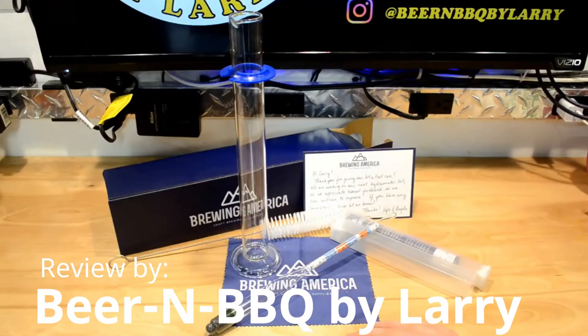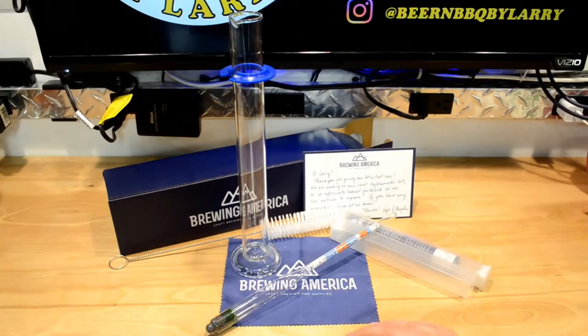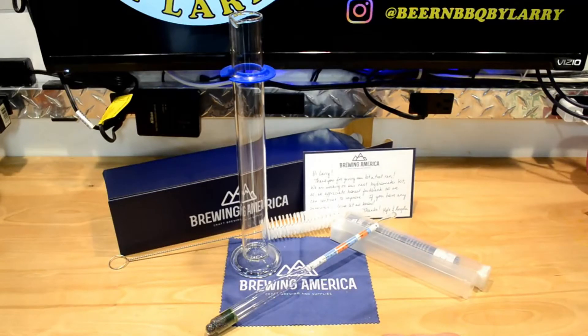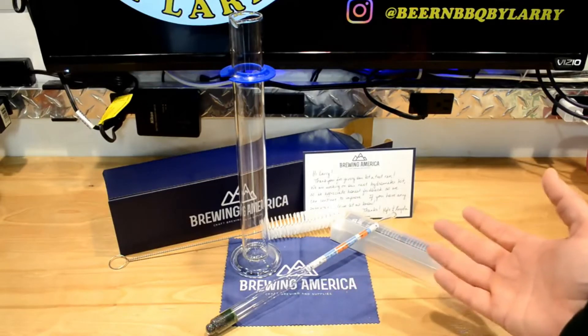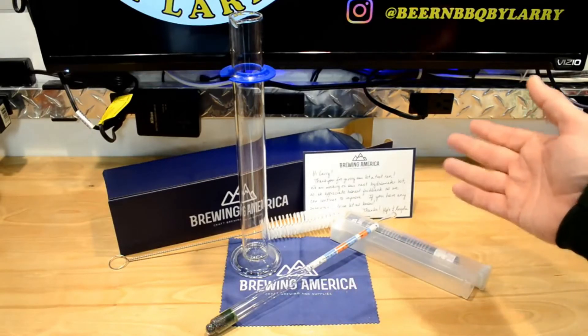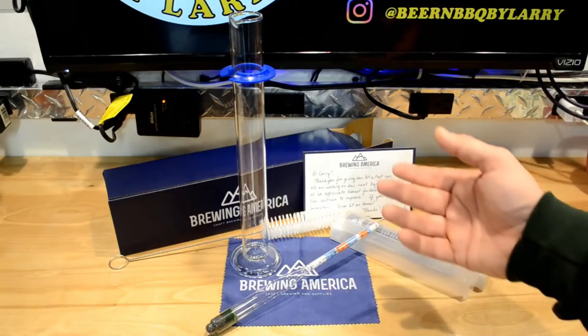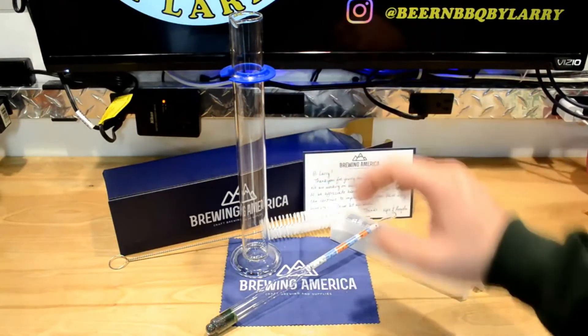Look what I have here folks, a hydrometer kit from Brewing America. Kyle, one of the owners, decided to send one to me to use in some of my videos. And what great timing, because I was wanting to get a new hydrometer and maybe do a hydrometer video anyway. What they sent me here is a kit that they sell online — on Amazon, for example — and it comes in a box that you can see in the back.